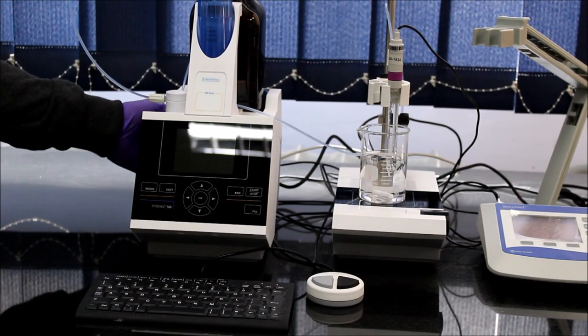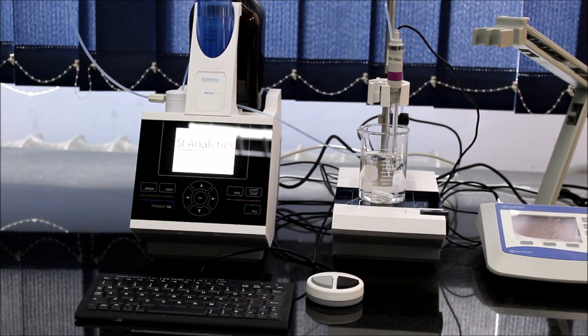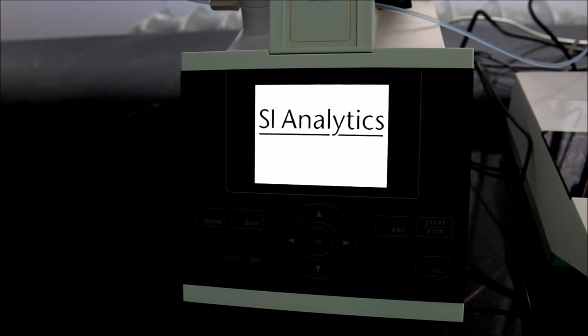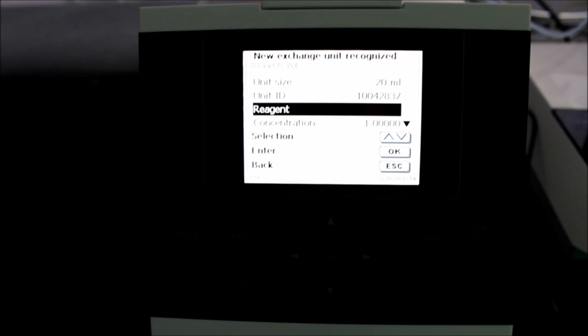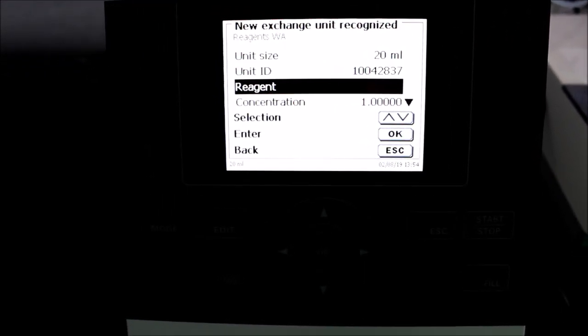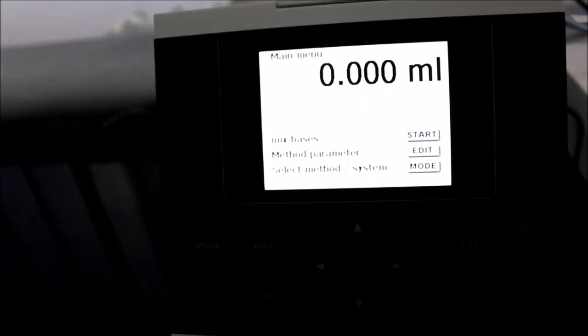Now let's turn on the autotitrator. It takes some time to fully load the program so be patient. The machine will beep shortly when it's ready, after which you can press the ESC key or wait again for the machine to go to titration mode.